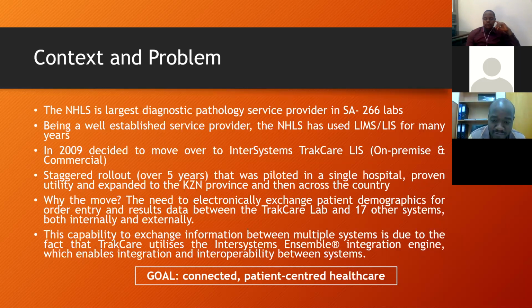To date, we've got 17 different systems that are integrated to TrakCare, which share patient demographics and results in the form of ordering and sending results back. So the TrakCare system is central. There's one single database and everyone connects to that database. And we also have a disaster recovery site. In case there's a disaster, we can switch over to another application.